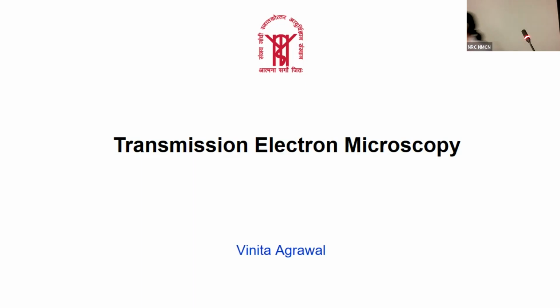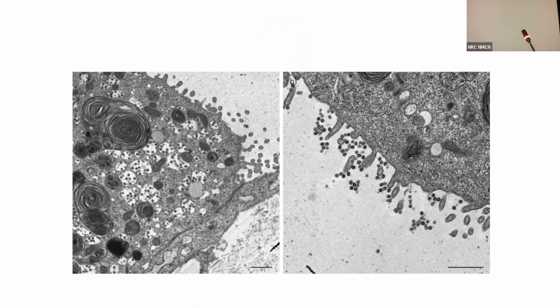So anybody can identify? You're looking at this. Okay, I'll tell you, this is from a lung. This is a pneumocyte, cells which line the alveolar space. Those can be seen by a light microscope. So why am I showing you this electron microscope picture?